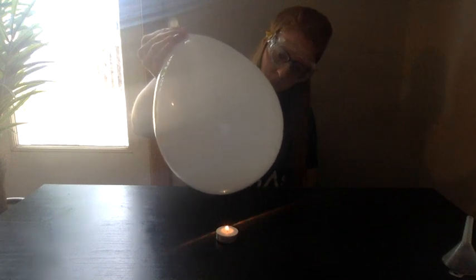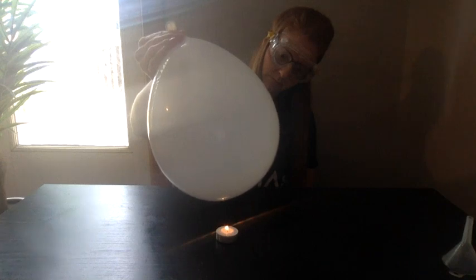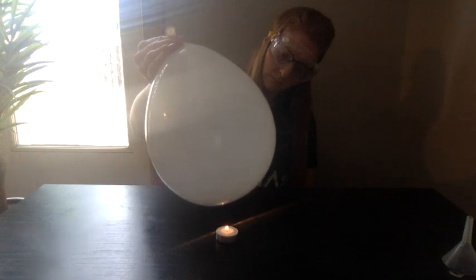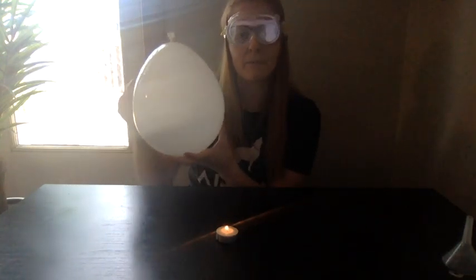There we go. Now notice it's not popping like the other one did.